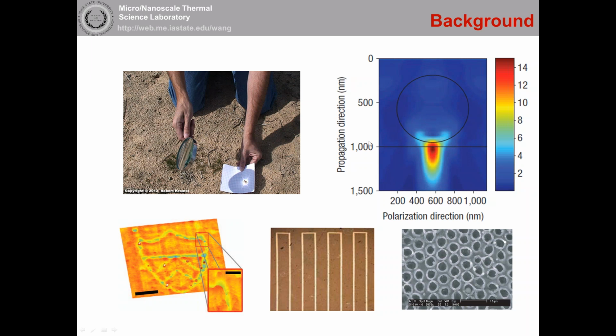This picture shows that if we place a particle, a micro-size particle, you can do the near field focus. And the light is focused to a really small area. I think the focus is around 200 nanometer, basically less than that. So now the question is: why do people want to focus the light to this small size? Basically, you can do nano manufacturing. You can use this tightly focused light to make lines on the surface, and you can make holes on the surface. So it's nano manufacturing on the surface.